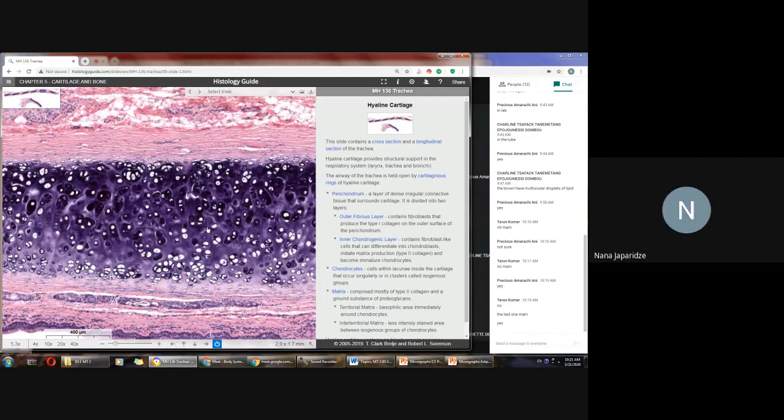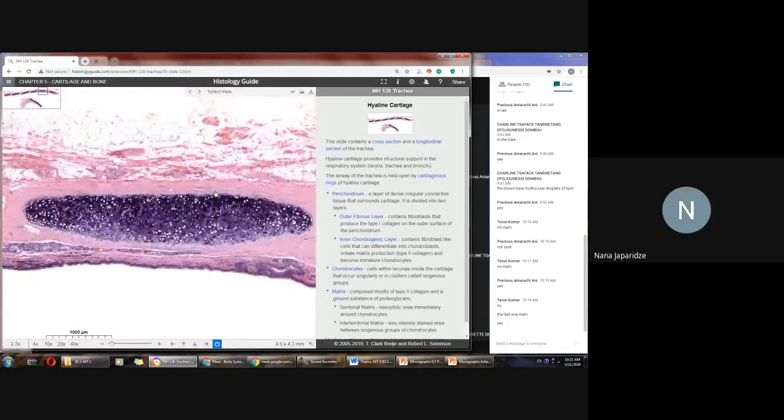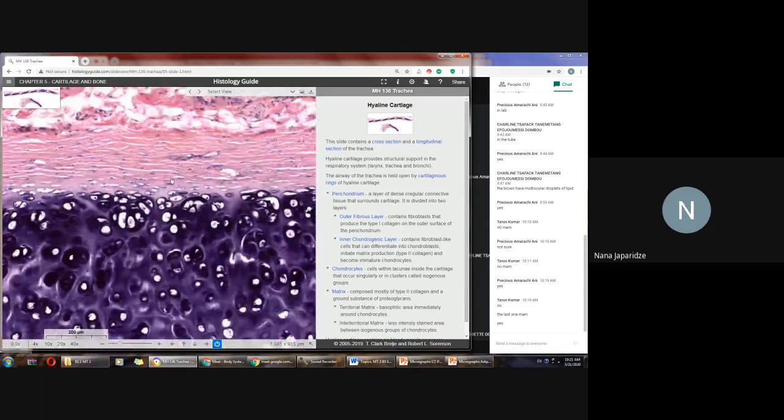Surface layer. So look, Tarun, please. This is small magnification. And you see the cartilage in the middle. This dark stained one is cartilage. And you see the cartilage is surrounded with different types of tissues. And first of all, if you magnify, you see that cartilage is surrounded with a growing cartilage. So this is the differentiated portion of the cartilage, and this is growing cartilage, not finally differentiated, okay?